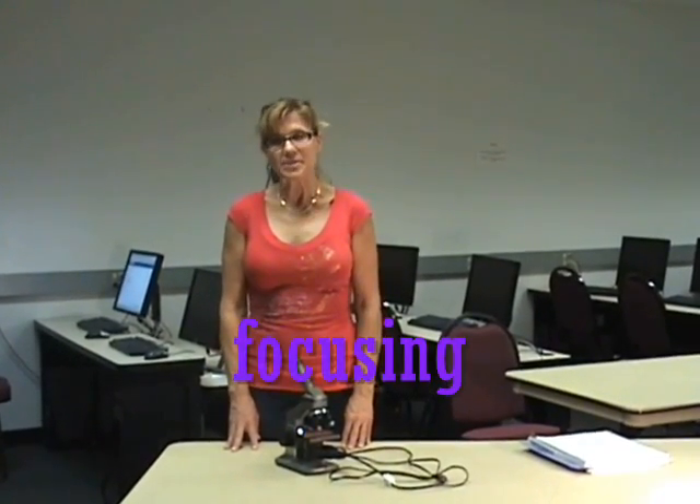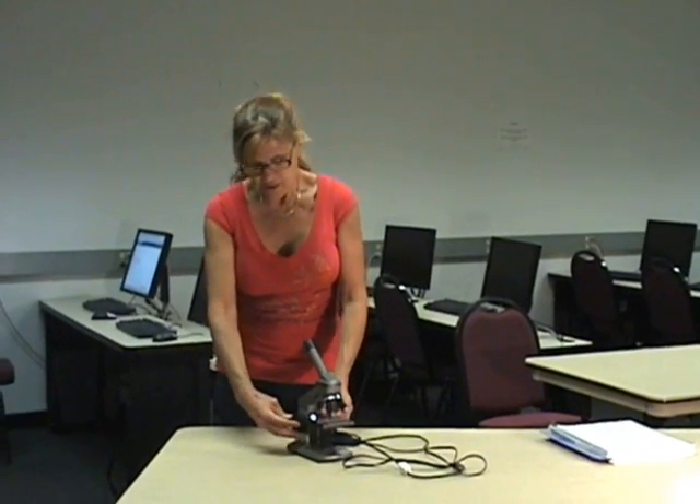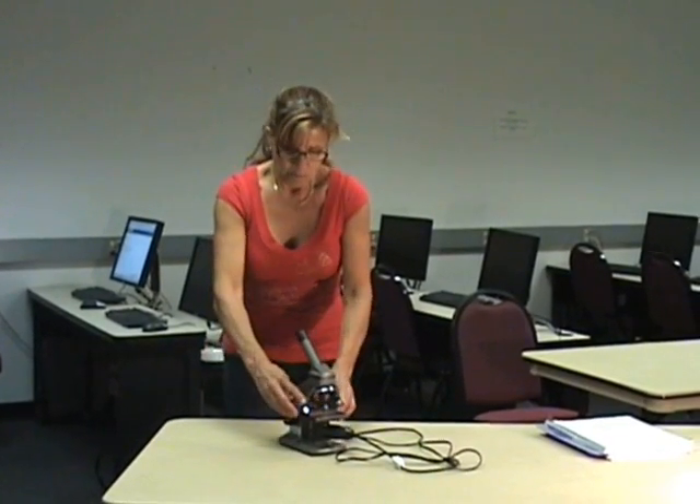Now we'll talk about focusing and actual use of the microscope. We're always going to start with the mechanical stage at its lowest point. Make sure by using your focus knobs and taking it all the way down. Slide your specimen tray in.